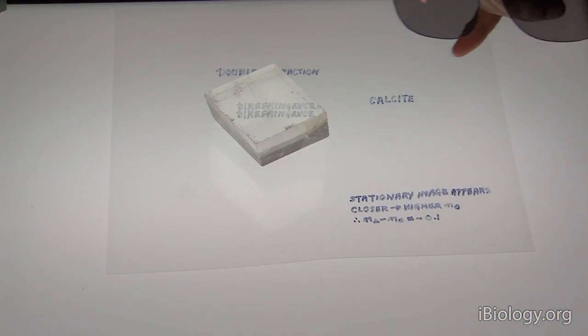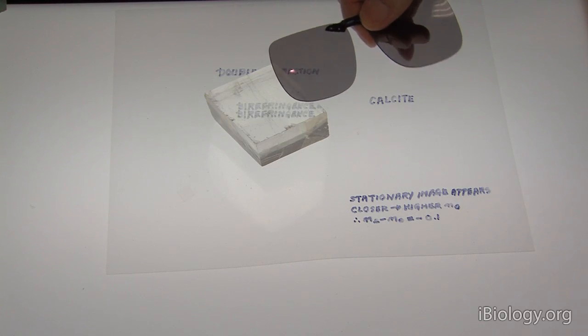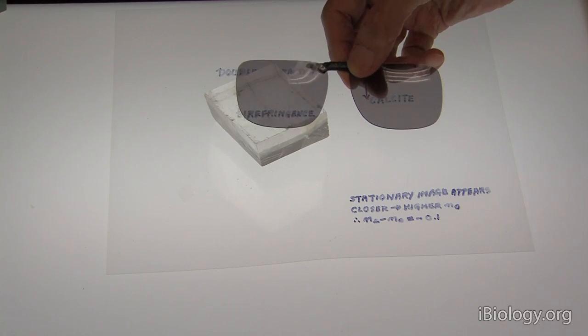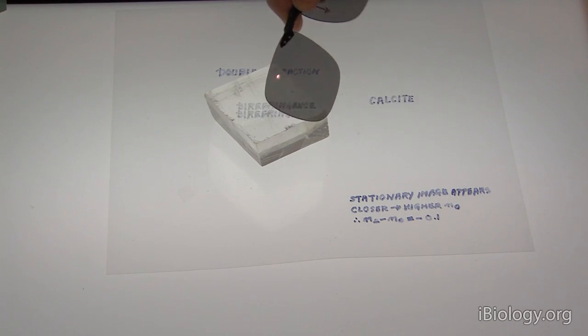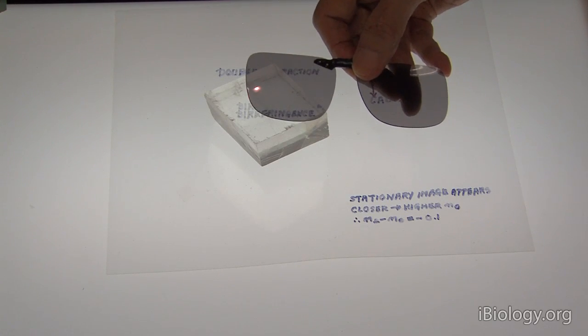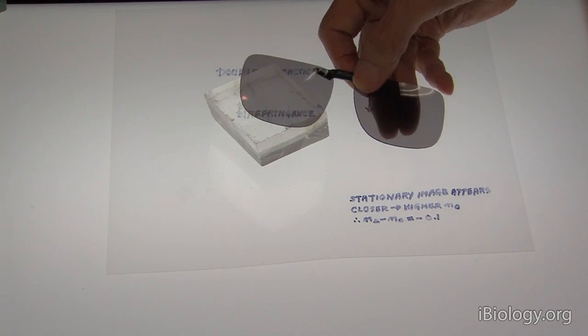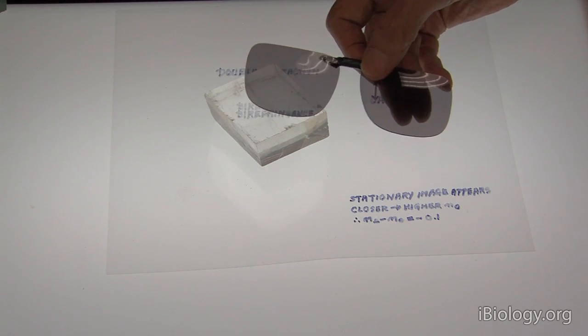Because it's double, it's called birefringence. But now, if we put a pair of sunglasses in front of it, one or the other of the images disappears. What this is telling us is that the light that comes through the birefringent material is itself plane polarized.